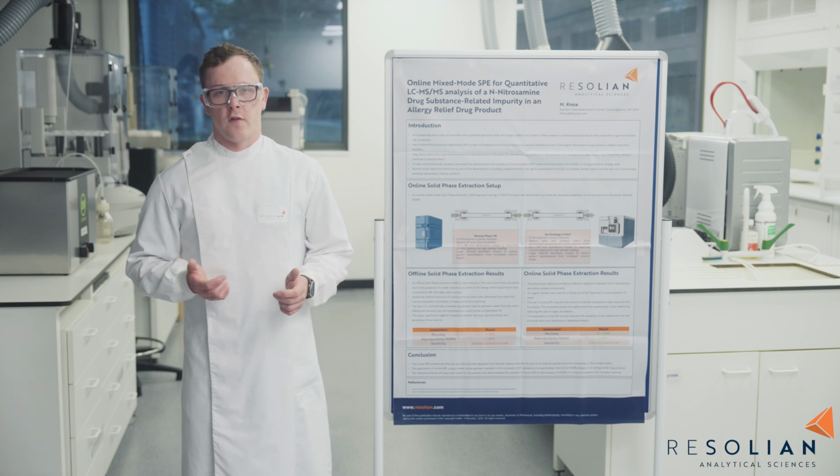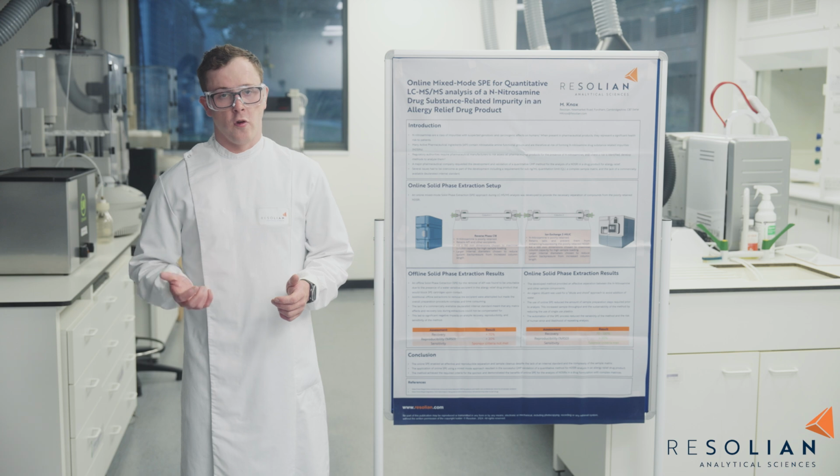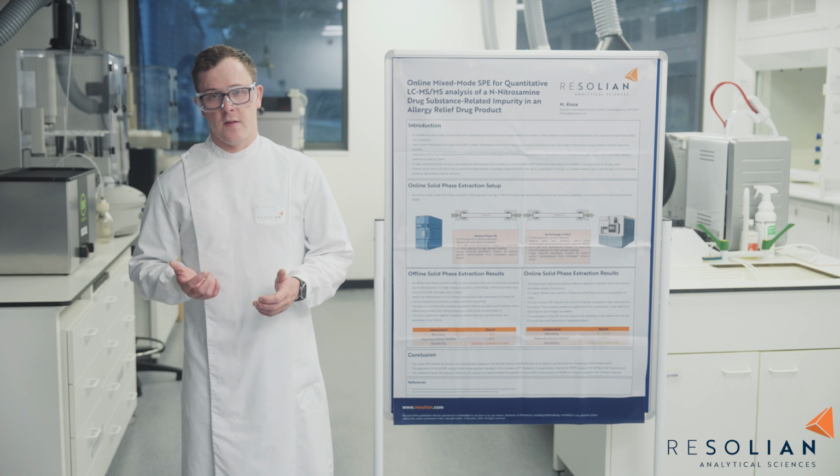Additional offline extractions were performed prior to the SPE step to attempt to remove the croscarmellose sodium. These extractions made the overall preparation procedure complex and time-consuming. The lack of a commercially available deuterated internal standard meant that any matrix effects and impacts during extractions could not be compensated for. This led to significant negative impacts on analyte recovery, reproducibility, and sensitivity.